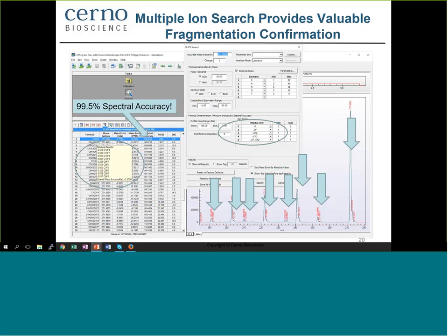Note that we can also set a min and max value for the number of ions allowed in the search for loss. Because we actually have multiple losses of fluorine in our mixture results here. We have C10F8, we have C10F7, C10F5, C10F6. So it's actually identifying and fitting all of those ion fragments, in addition to the other ion fragments that we've proposed here.